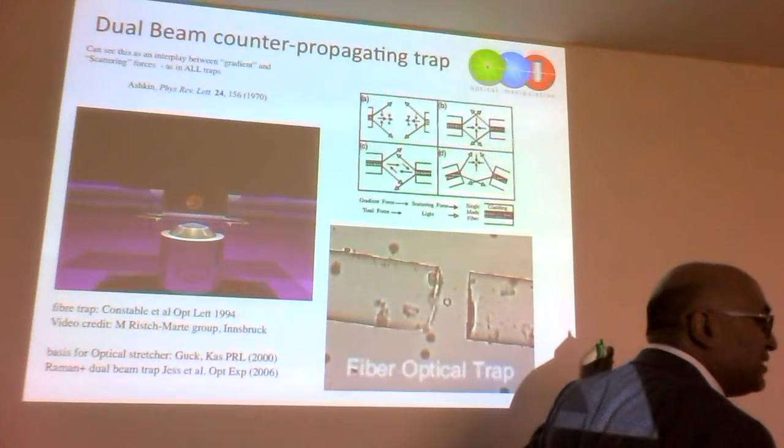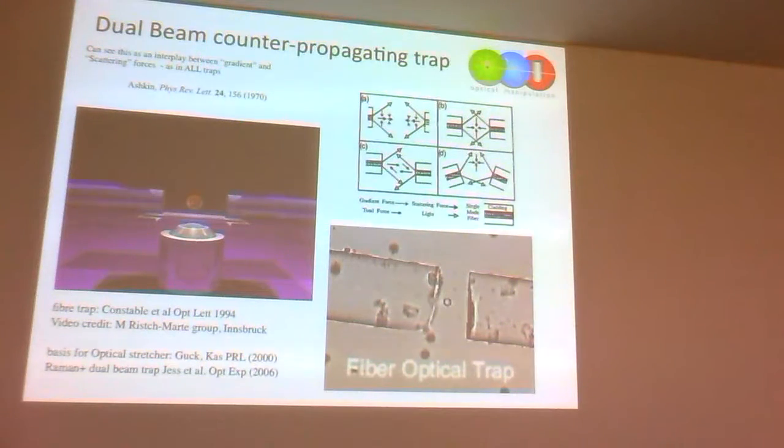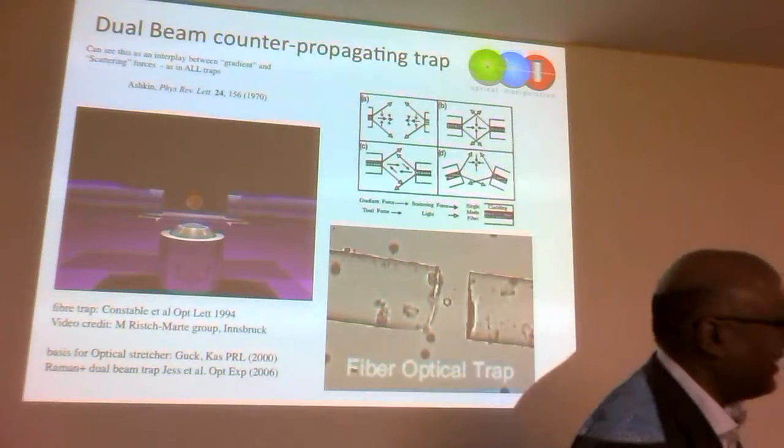So these are beads. Okay. Sorry. Even if they were cells, they would stay the same. They would probably just flip and orient, but they would stretch or contract if you increase the laser power. This is quite low laser power. And I'll do that actually in the next slide.